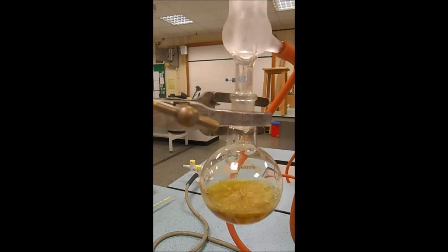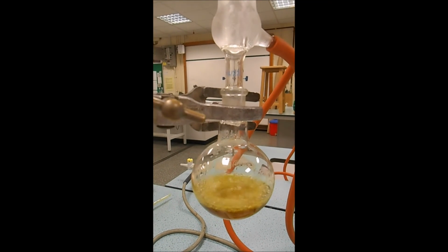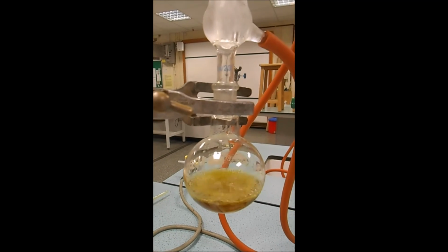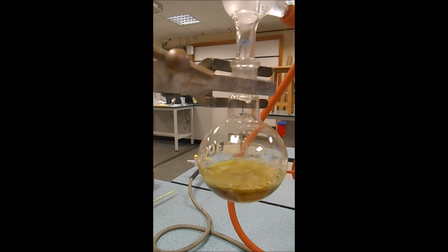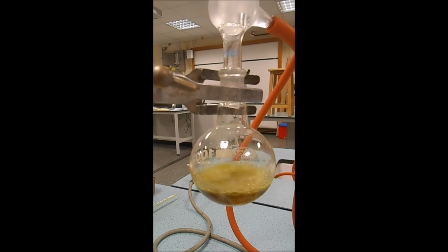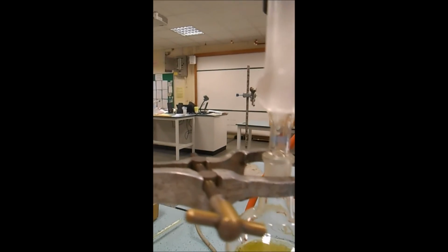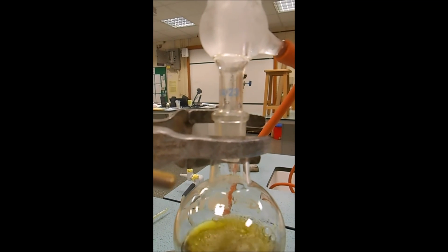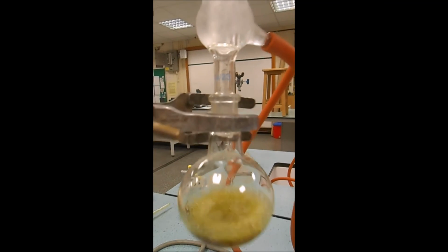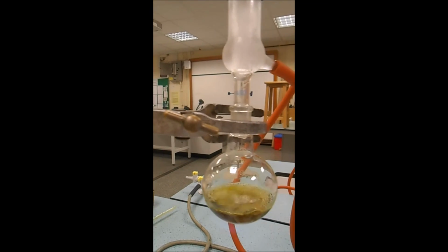Again, gentle heating, and this time you can really see that that's going greenish already. So we're on a rolling boil now, and you can see it's dripping at the bottom there, dripping out of the condenser, and that is a reflux. And at the end we should have some propanoic acid.